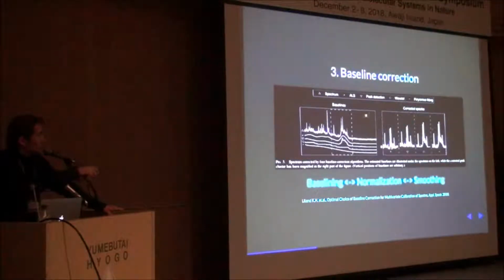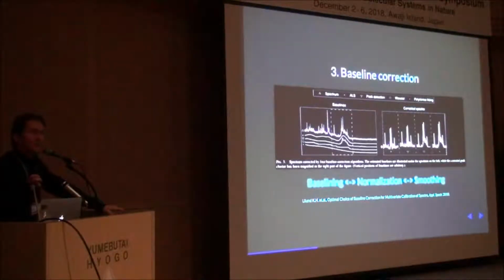And apart from this, I've had most experience with wavelets, and I can assure you that using wavelets, you can get any of these results. And I think that goes for other methods, especially polynomial fitting. Any of these methods can generate all of these results if you know the technique well enough and if you can manipulate the parameters right.